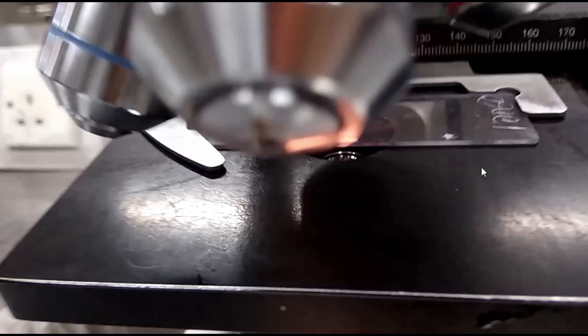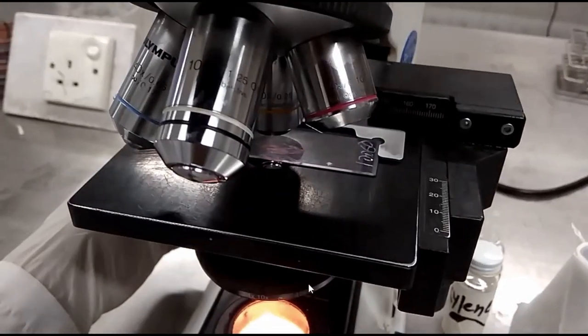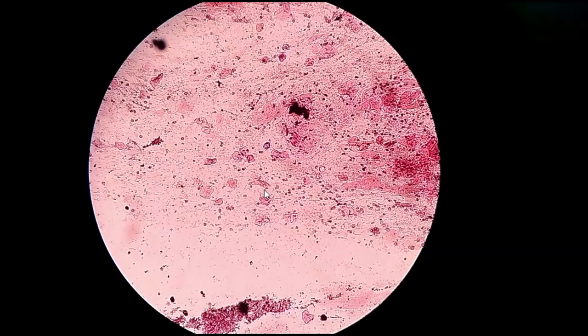Practically, here you can see this one is the slide. We are going to focus at 10x. According to the objective lens, we can adjust the aperture. So, when you are using the 10x objective, you can first use the coarse adjustment, then for clarity you can use the fine adjustment. With the 10x objective and 10x eyepiece, it is 100 times greater than its actual size.